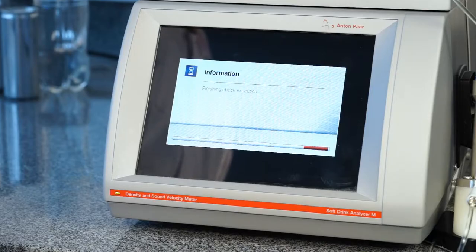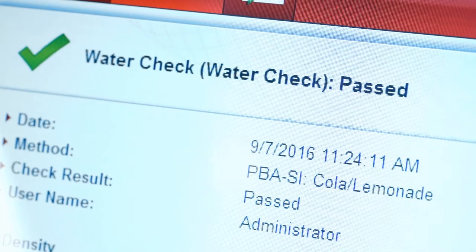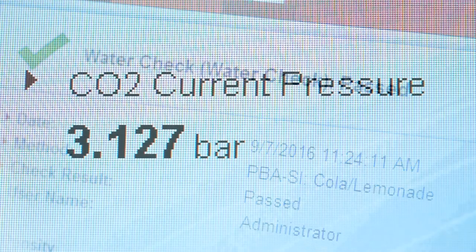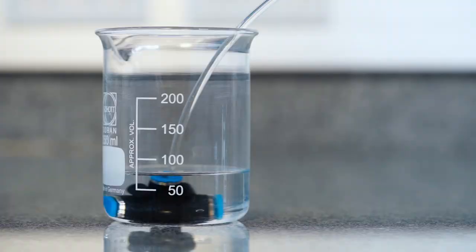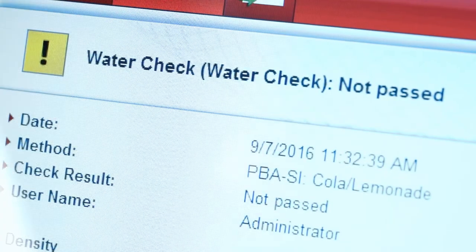The instrument will automatically present a report at the end of the water check. Even if the water check has failed, the instrument will tell you. If the pressure is too low, the sample volume is not enough for your configuration, or the water check should fail, please refer to the instruction manual.